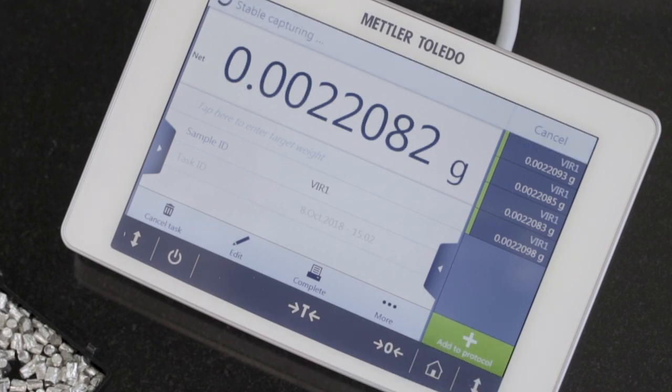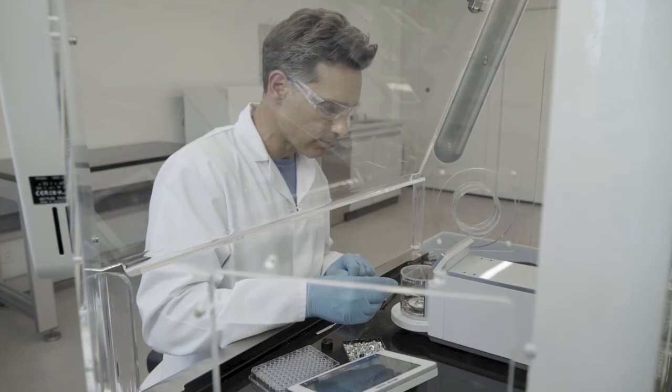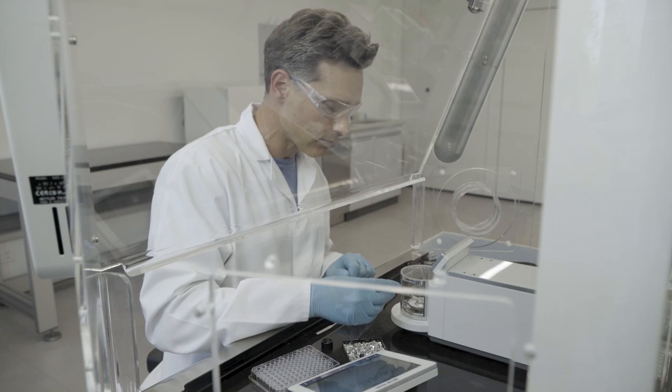Each result can be saved directly to the built-in results protocol. All relevant metadata such as time, date, user ID and instrument status are included.